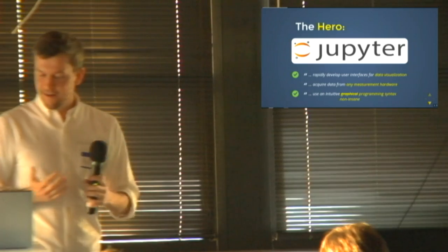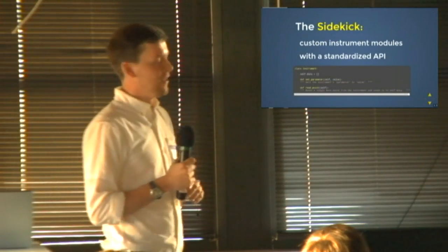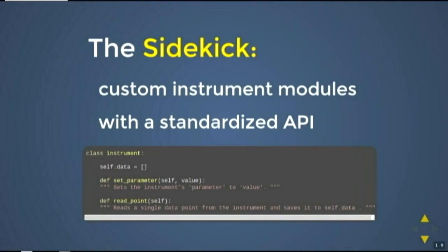So what we did in our lab is we made up a sidekick for the Jupyter Notebooks in the form of a suite of instrument modules that talk to each of our instruments. And this is actually where the bulk of the work in this project went.